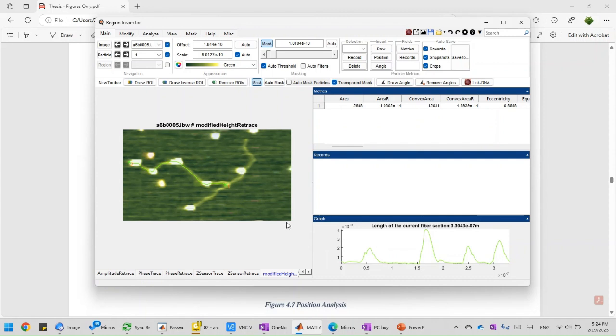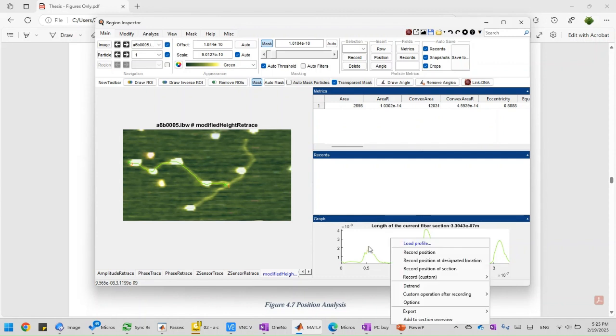Okay, one short DNA that has the specific site, and one long DNA, which is just homoduplex, right? So one heteroduplex and one homoduplex. Right now the 330 nanometer DNA is a heteroduplex, so it has the specific site. So what I'm going to do is click this and find peaks and span.